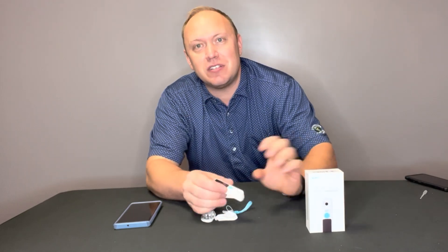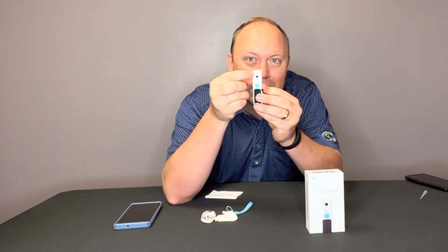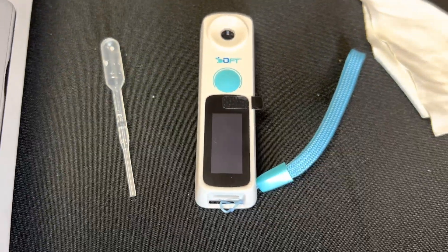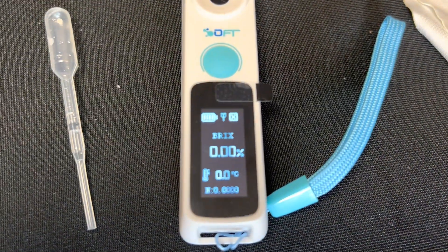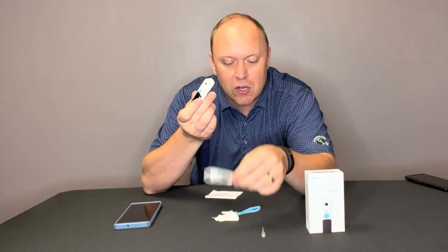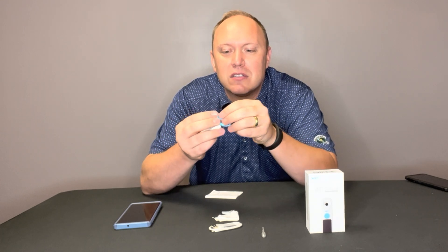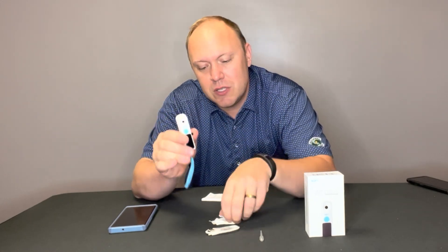It's a cool little device here. I've already unboxed it — you can see it's this small, sleek device. It has this little eye, and the eye allows you to drip a solution on using this pipette. You drip it on there and it gives you a reading as to what percentage of the solution is sugar. It also has its own internal battery and USB Type-C charger, and it comes with a little rope handle that attaches like so, making it easier to carry around the kitchen or laboratory. That's everything you need to get started.